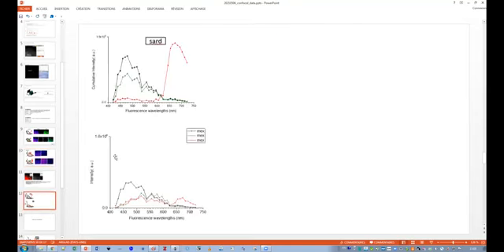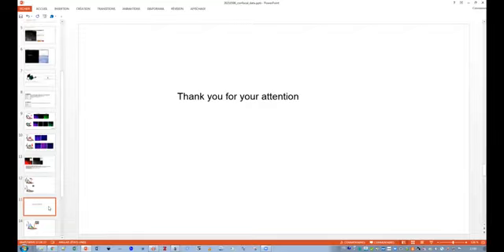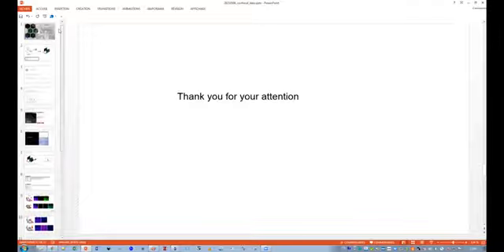And finally, when I extract the fluorescence spectrum, I think that my black spectrum is different from my green spectrum. So I think that I have 3 different spectra, and I would keep 3 components to explain my fluorescence signal. So that's it. I showed you all the steps I know for processing my confocal data. I hope it was clear, and you can ask questions about it, and we can discuss, of course. And I will share with you all the protocols so you can use them as many times as you want.